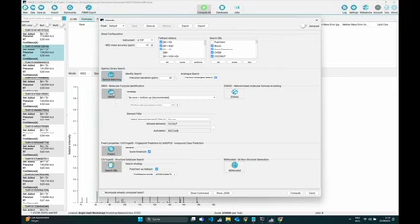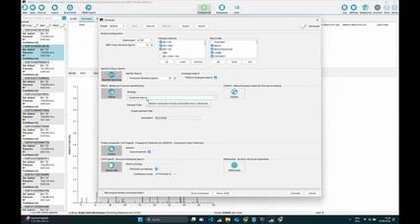Now, SIRIUS: this part here is where you identify molecular formulas, and Markus already went into the strategies in some detail, so I'm not going to explain them now. But the recommended option is to do de novo identification and bottom-up search. You can change the strategies here. If you, for example, only want to search in databases, you can select this. But as Markus said, then you won't be able to identify truly novel formulas. But let's just stay with the default.